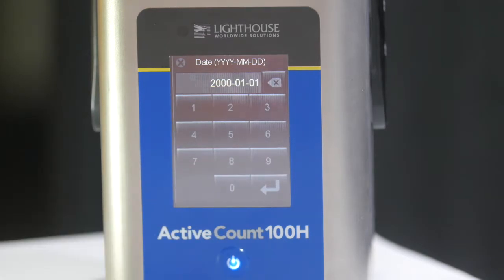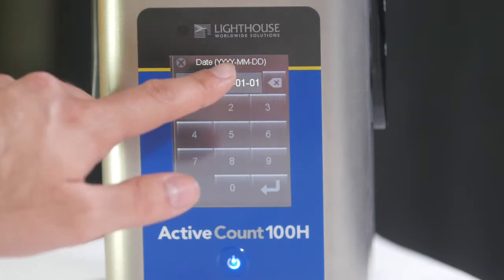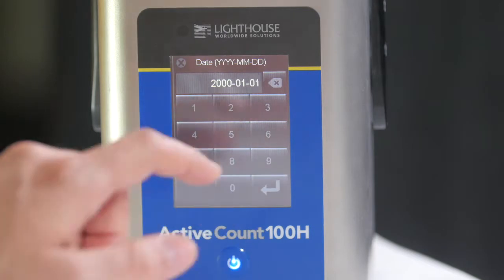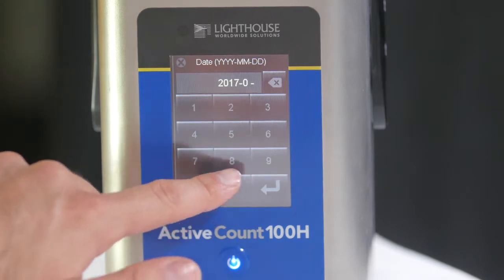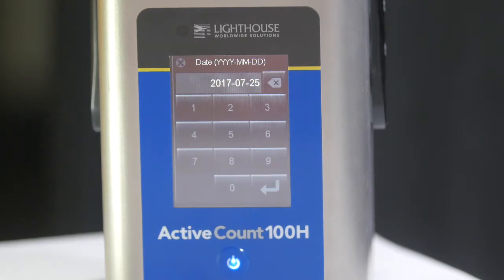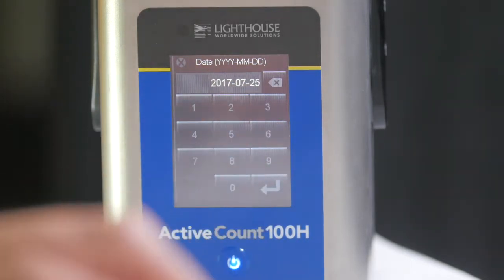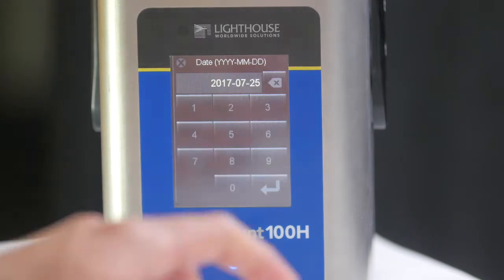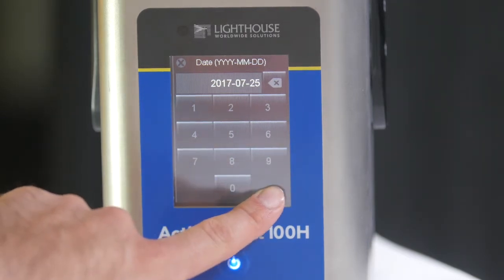First, we will enter the local date. Enter the current date as specified on the date screen. The date format is year, followed by month, followed by the day. Enter four digits for the year, two digits for the month, and two digits for the day. We can delete the characters we just entered by pressing the backspace button. We can cancel out of the screen without saving any changes by pressing the X button, or we can enter our changes by pressing the enter key, which will also take us back to the settings menu.